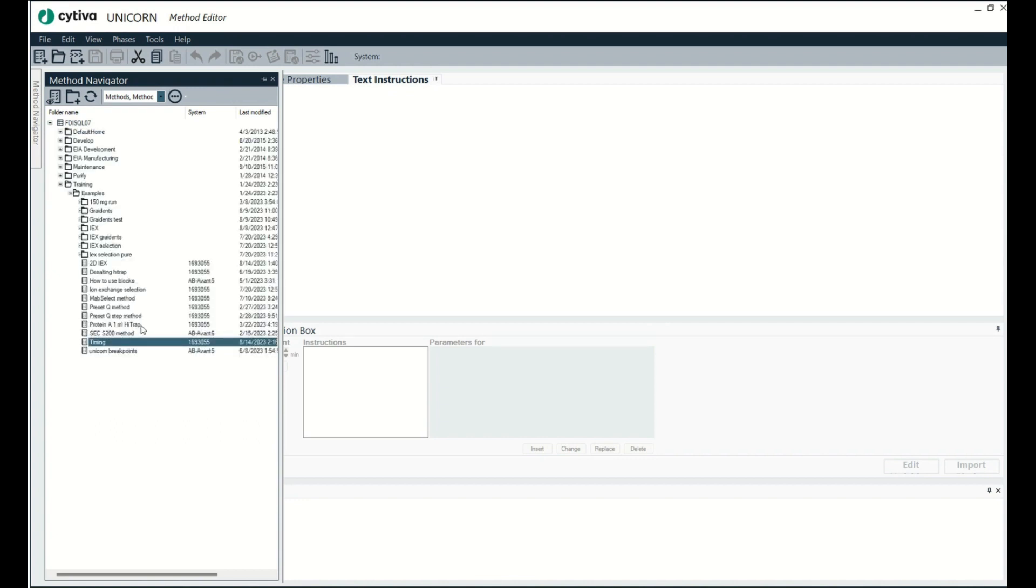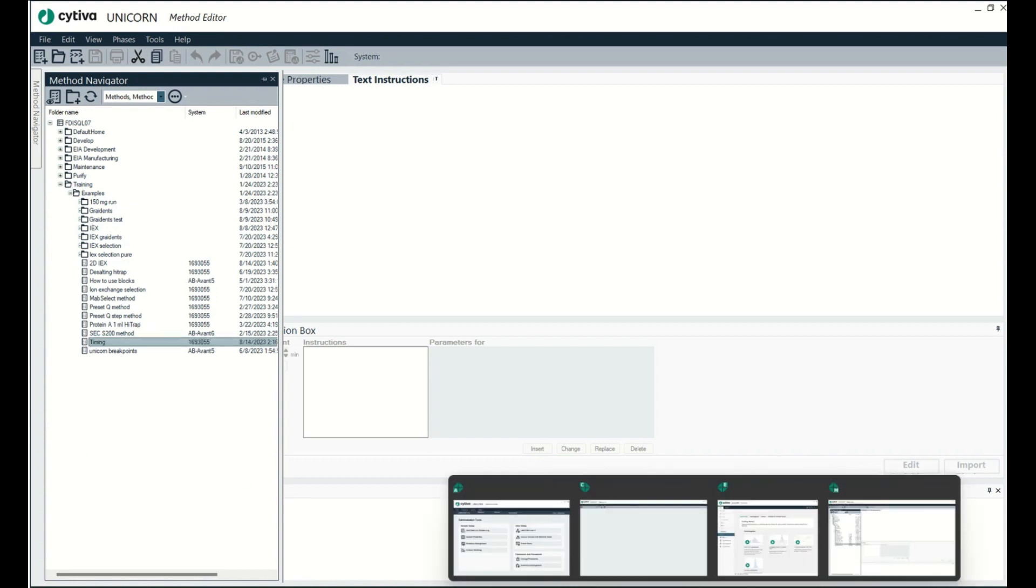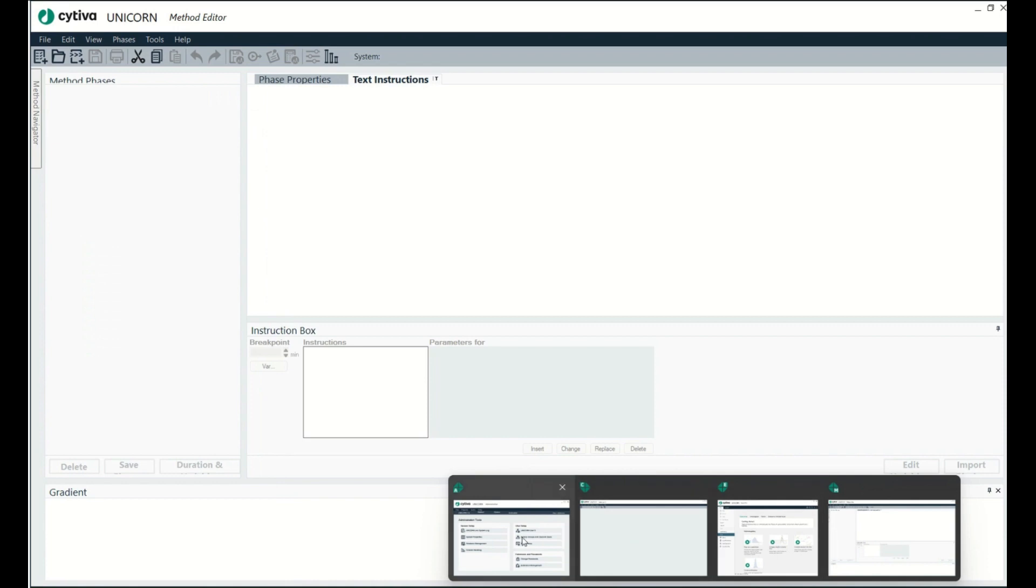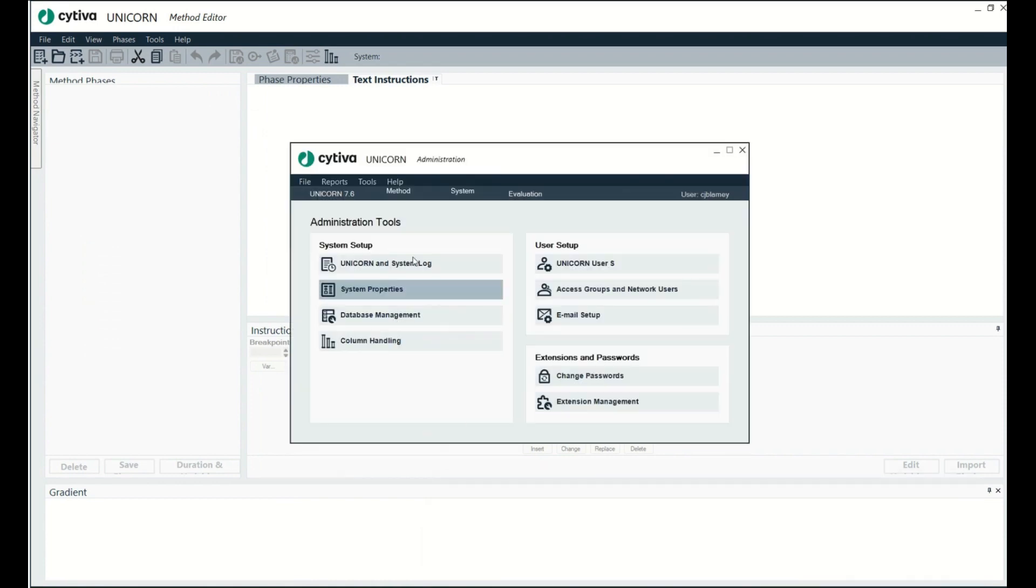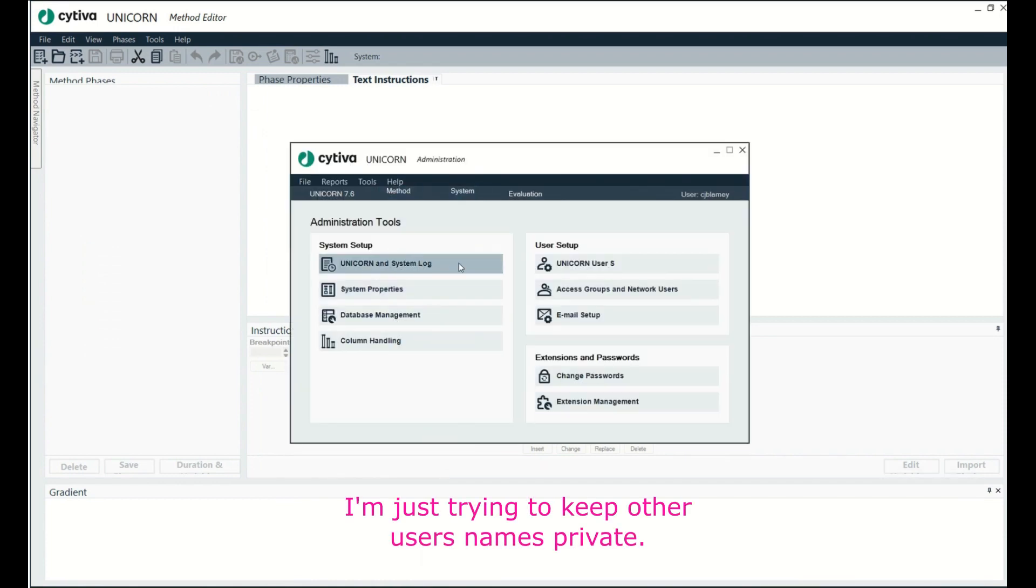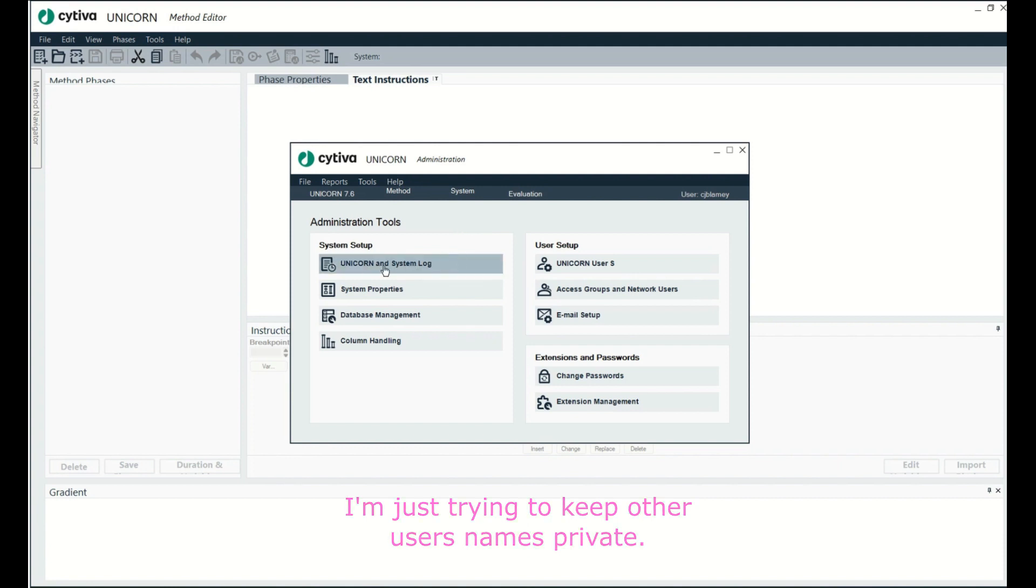So you haven't gotten away with anything though. The systems log is recording everything you do and systems log is here in administration. I can't click on this to show it to you because there's lots of other stuff going on behind here that I can't show you.